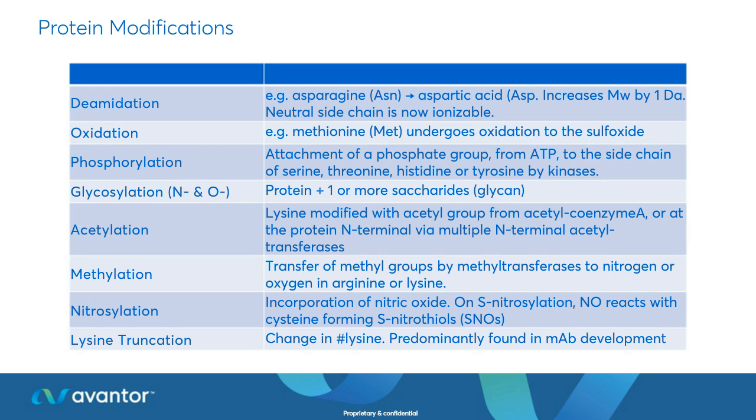For example, with a monoclonal antibody, we're commonly expressing those in mammalian cell culture. Then we purify the antibody with lots of chromatographic steps and filtration. We'll look at affinity chromatography, ion exchange, probably some hydrophobic interaction. And that resulting high purity bulk drug substance will still contain different variants of our antibody. And that's based on charge, size. They can have one amino acid difference.